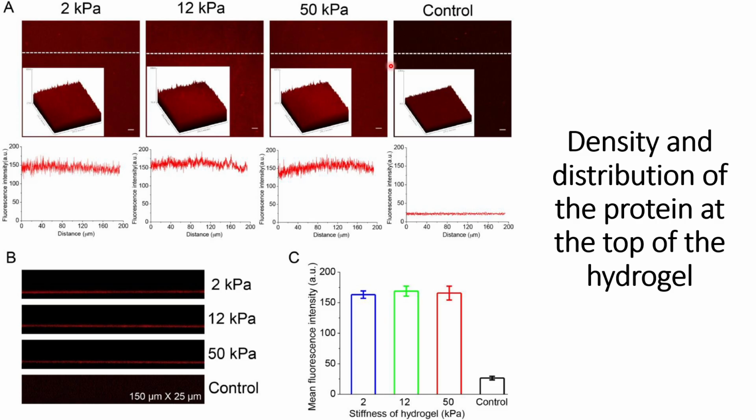Then they used PE anti-IgG antibodies that can bind to this biotinylated anti-CD3 and express fluorescence corresponding to the PE channel. This is their plan to check whether CD3 is distributed across the hydrogels or not.